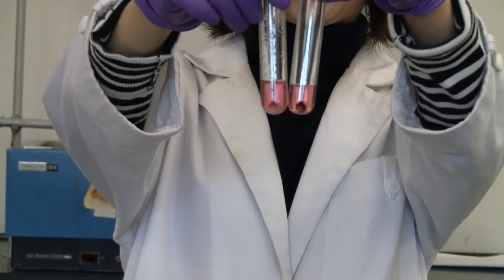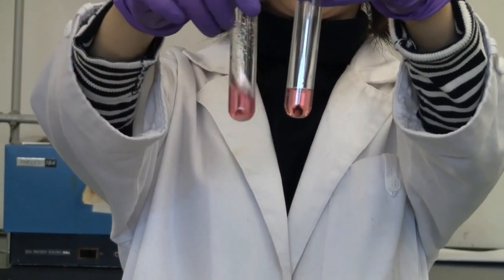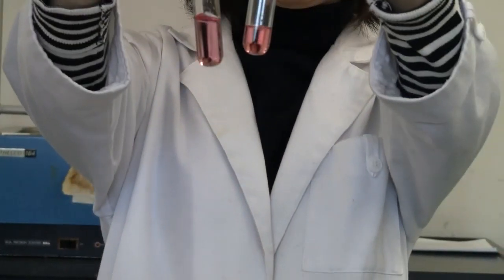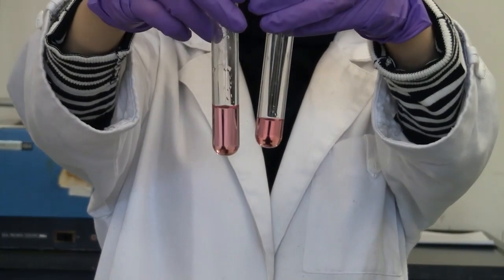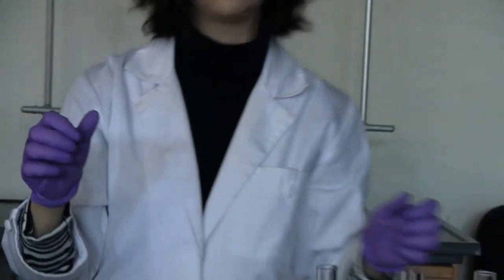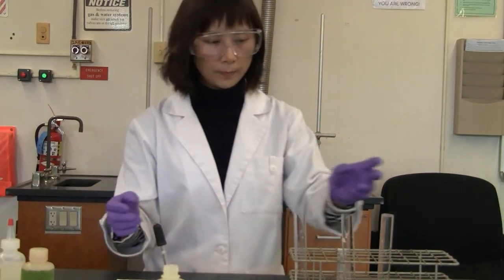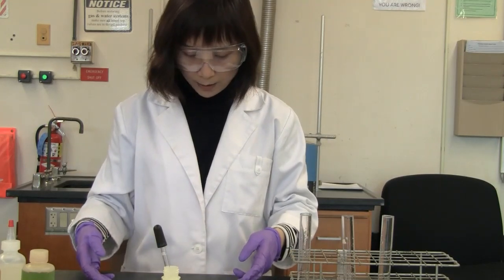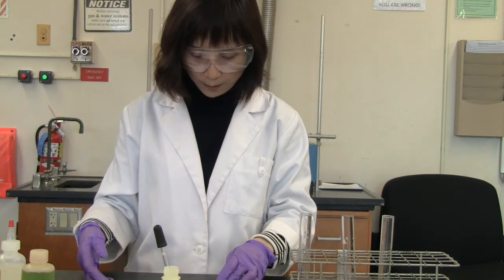So there are some changes, right? Is it more pink or more blue? Yeah, compared to this one, this one is more pink or more blue. What do you think? Okay, maybe slightly changed. You need to observe carefully. Okay. All right. So now move to step 4.